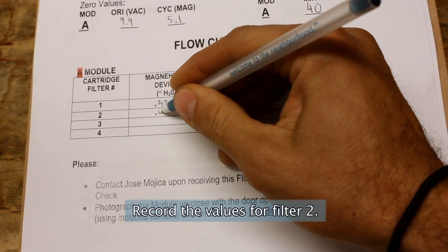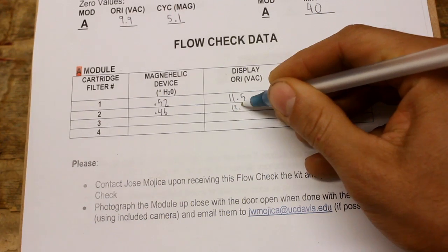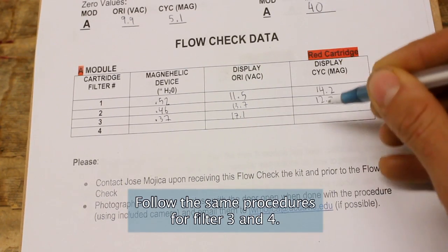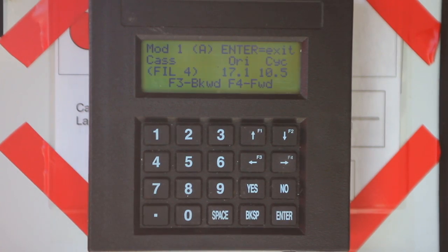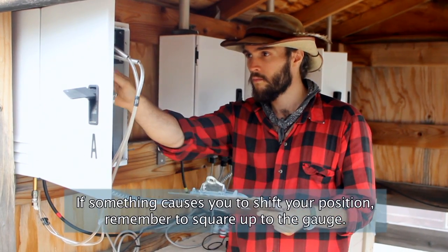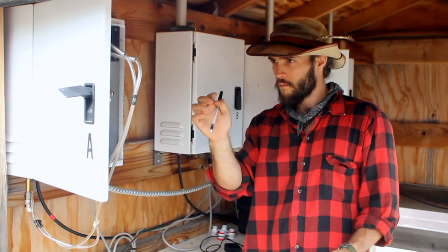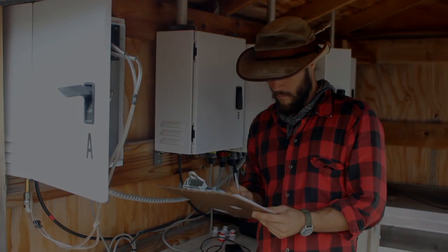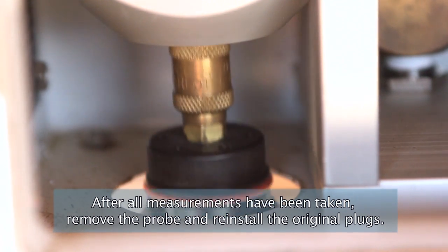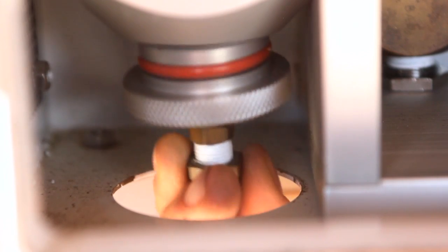Record the values for filter 2. Follow the same procedures for filter 3 and 4. If something causes you to shift your position, remember to square up to the gauge. After all measurements have been taken, remove the probe and reinstall the original plugs.